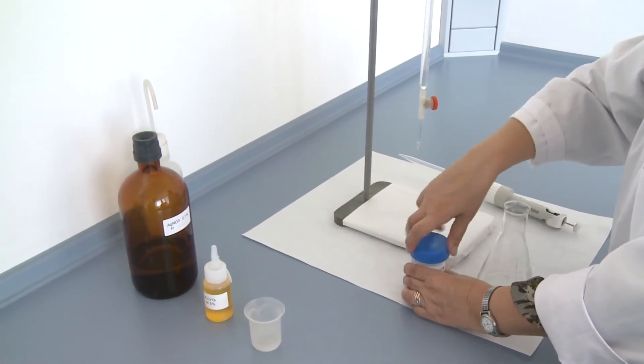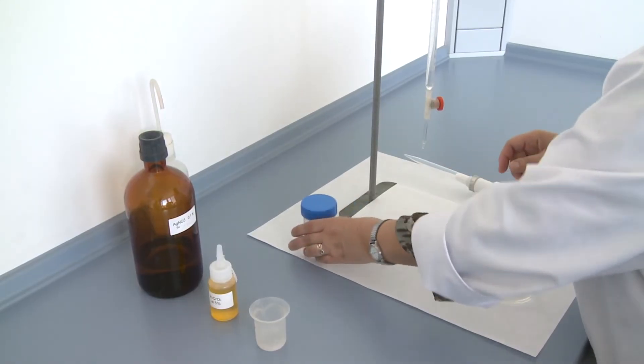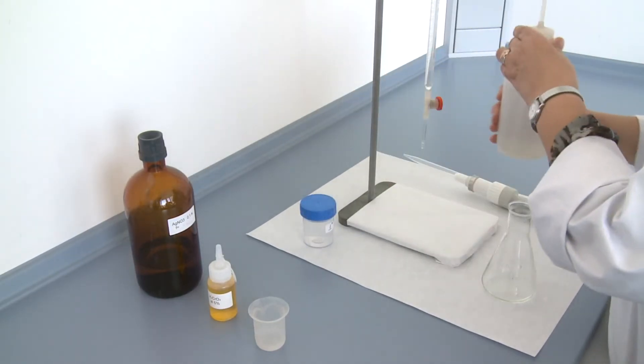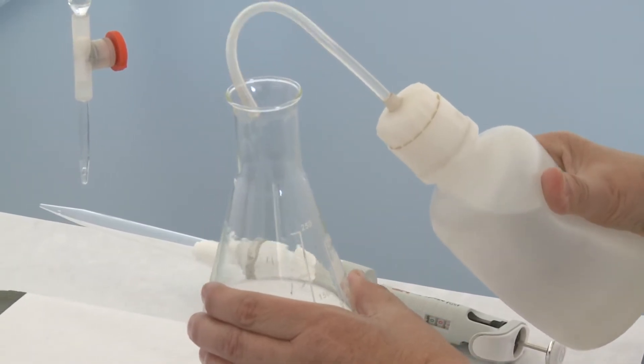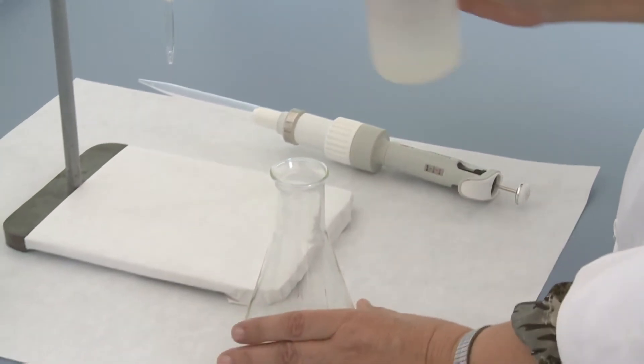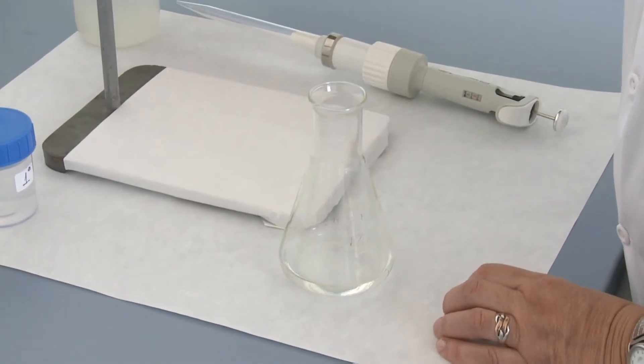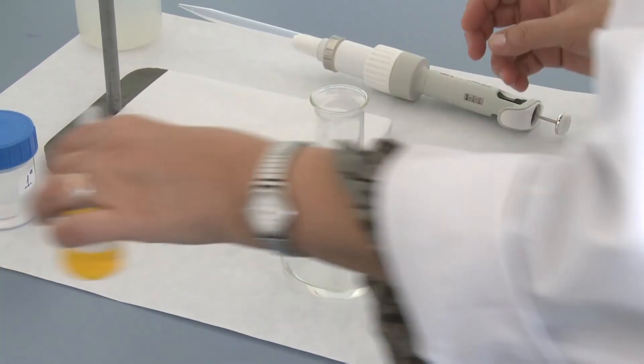Then add about 50 ml of distilled water to dilute it. Add 3 or 4 drops of the indicator potassium chromate to 5%.